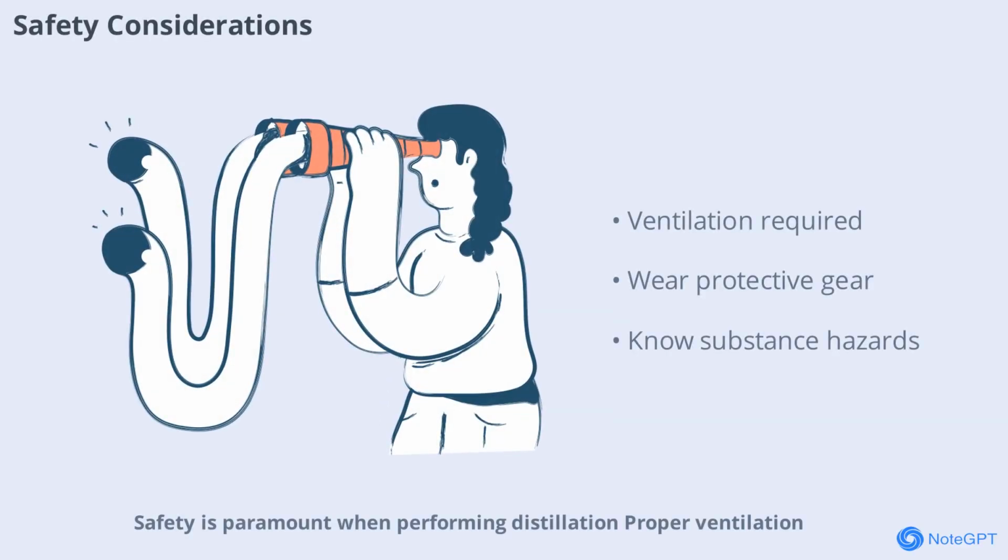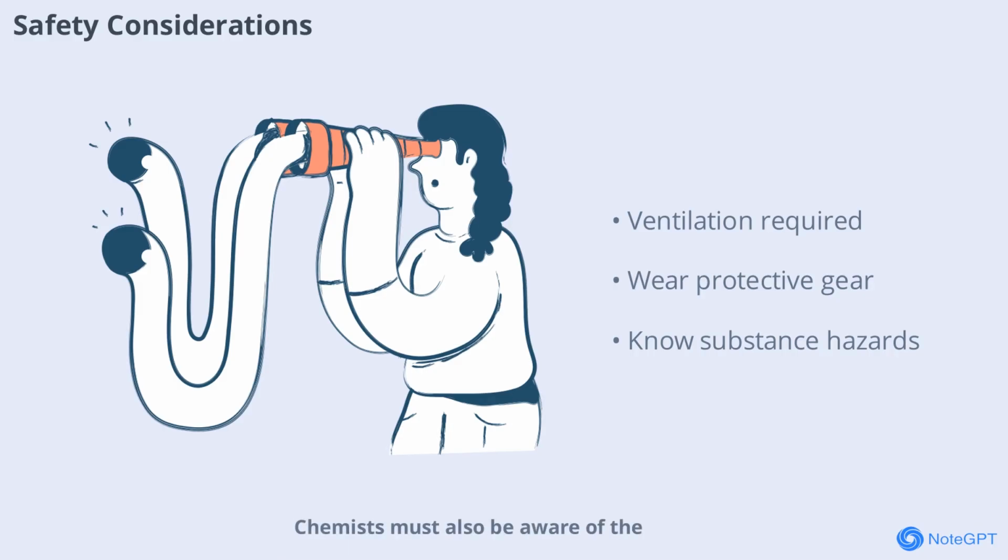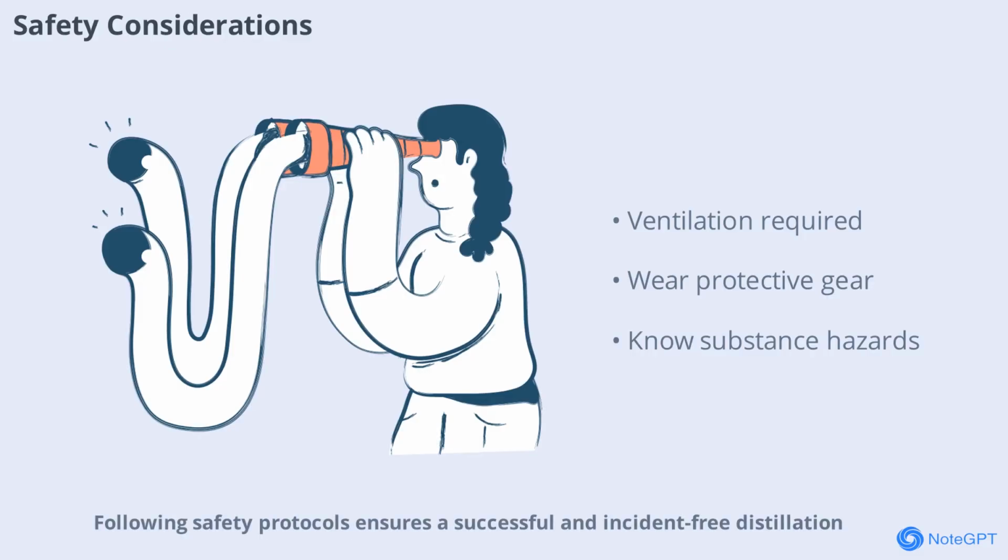Safety is paramount when performing distillation. Proper ventilation, heat-resistant gloves, and eye protection are essential. Chemists must also be aware of the properties of the substances they're working with, as some can be flammable or toxic. Following safety protocols ensures a successful and incident-free distillation.